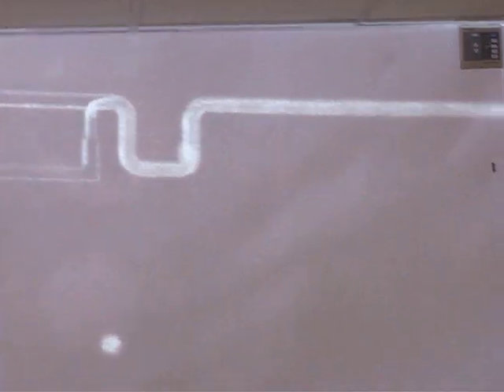So, here it is. This is where the bubbles are actually made. You can see two pipes come from the left corner. Yes, I can see them. The top one is, we call it the continual phase. And in there we have oil running. And in the lower one is water injected into the continual phase.